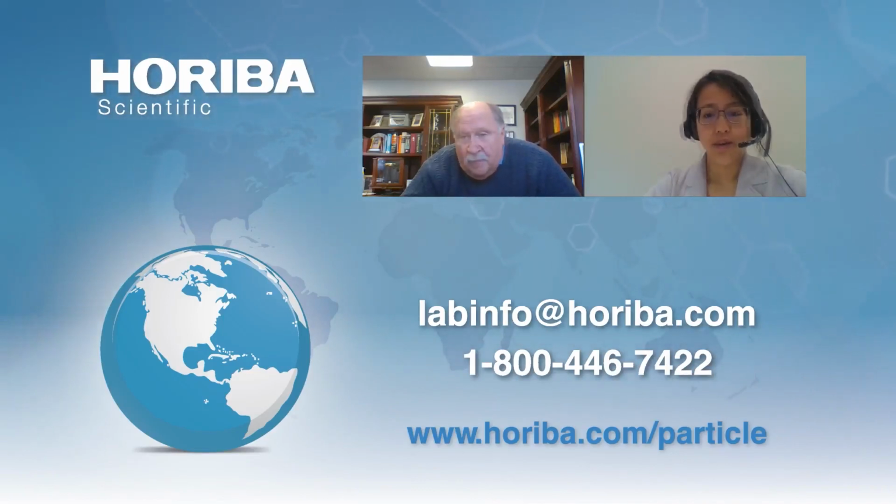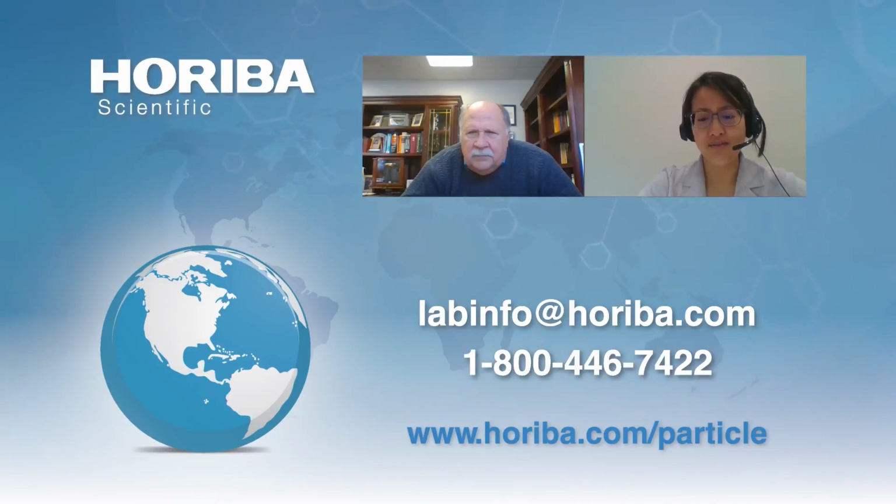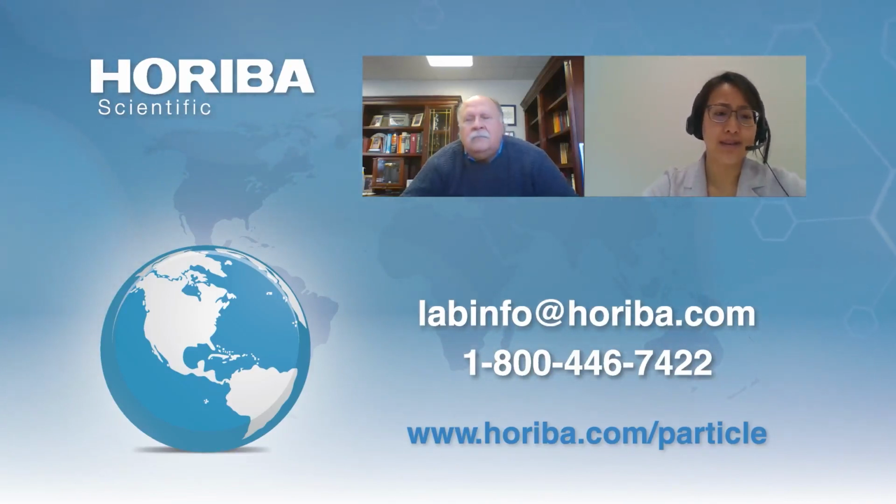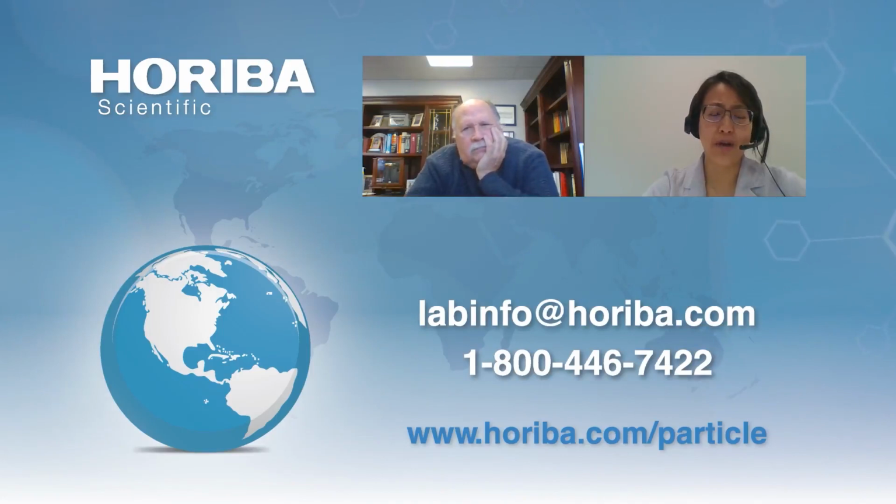Thank you. Now the next question, I can see this is coming from a person with a pharma background. Laser diffraction measurements of needle-like particles, 10:1 aspect ratio. Can you comment a little bit more about that?